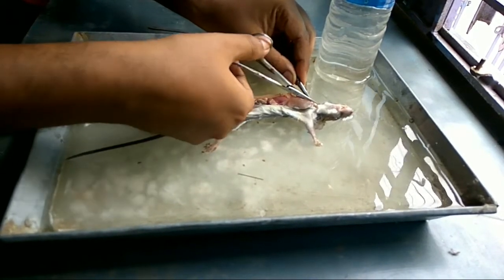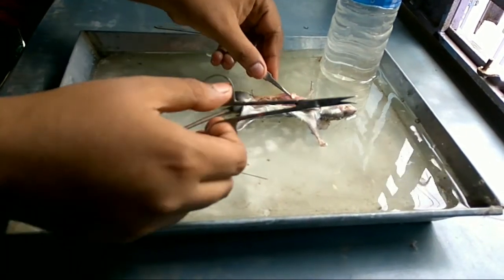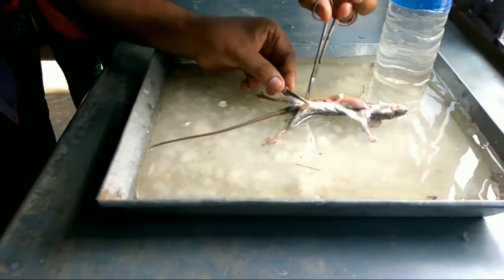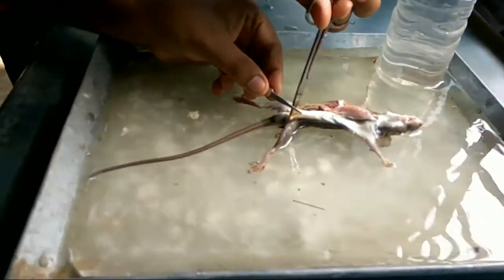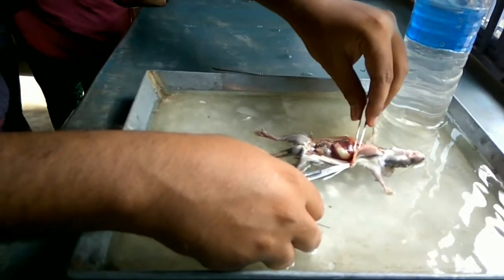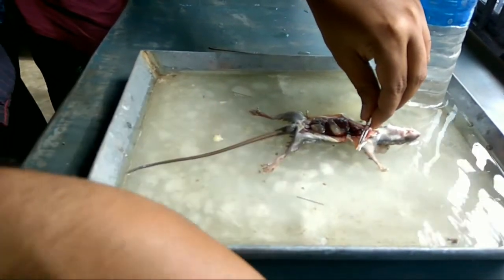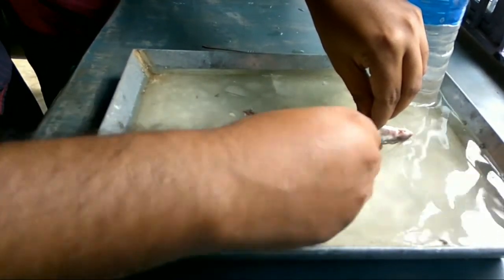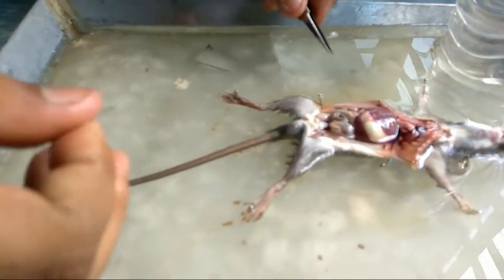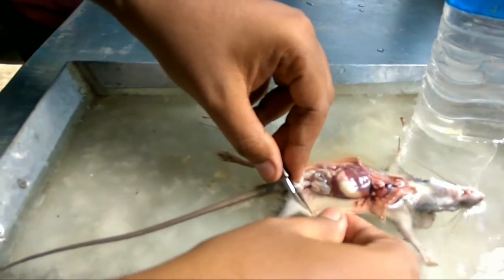In this region you have to be extra careful because very delicate organs are lying just beneath. You can give a lateral incision towards the femurs, which will help you to open up the skin.